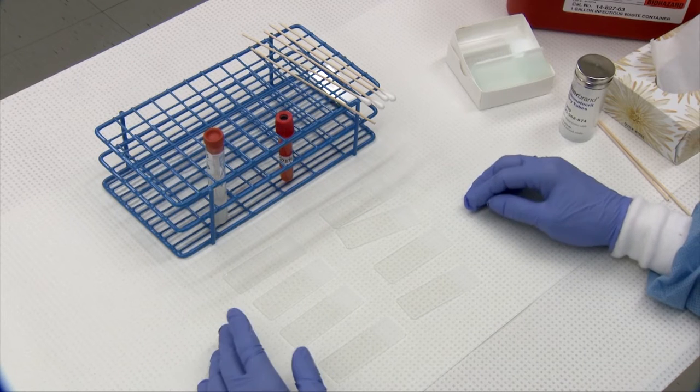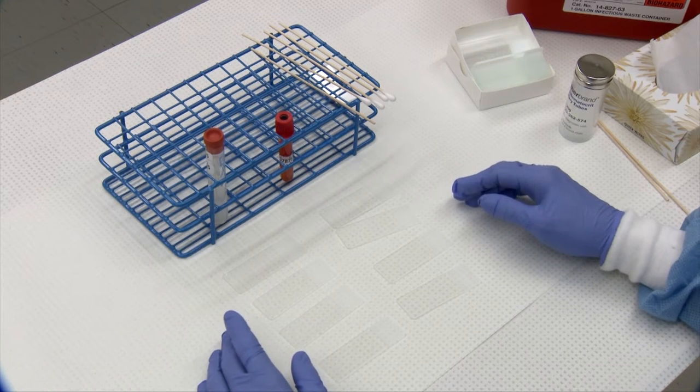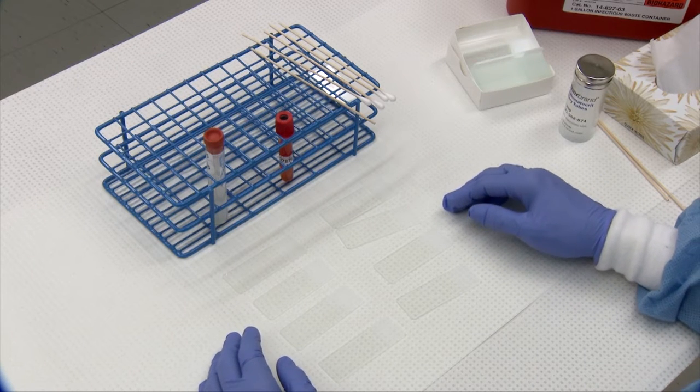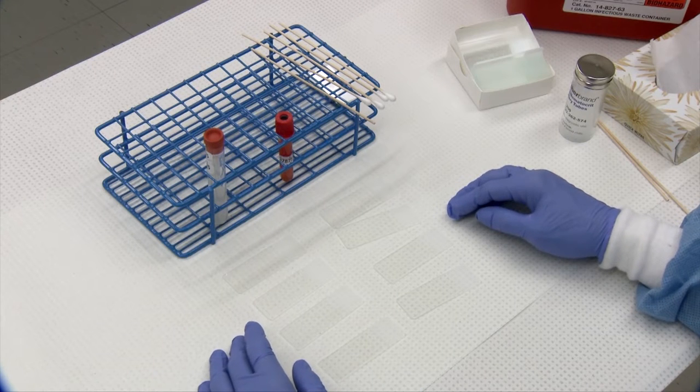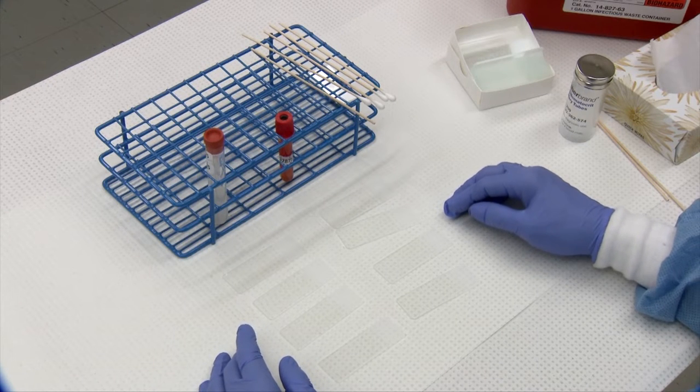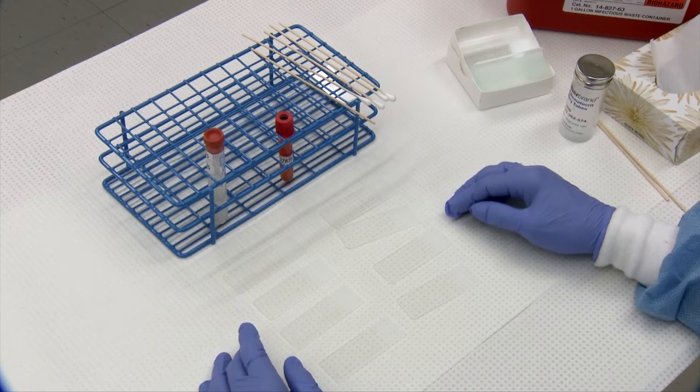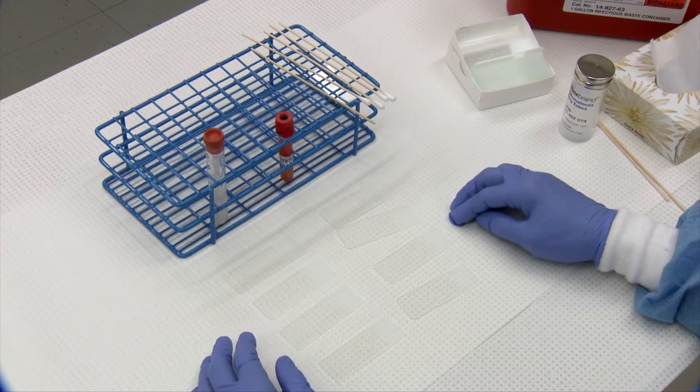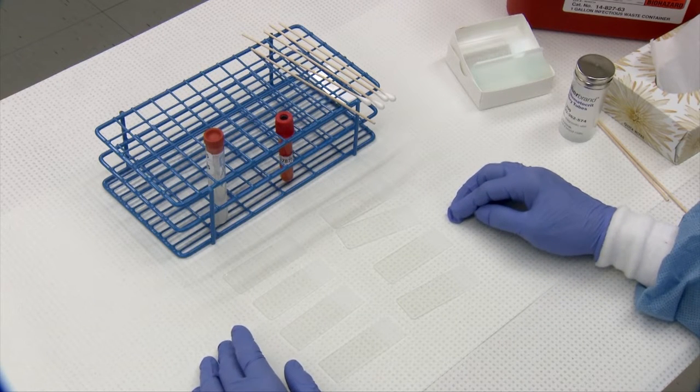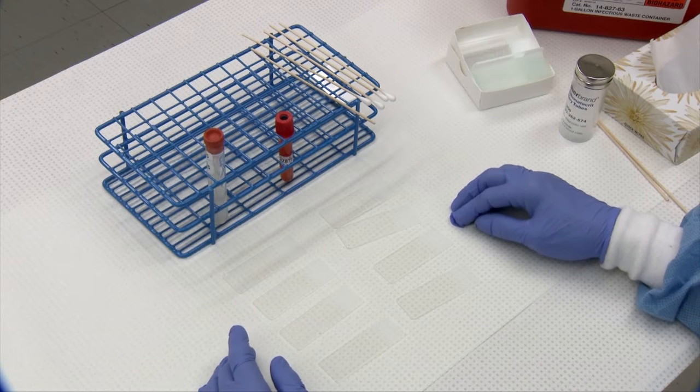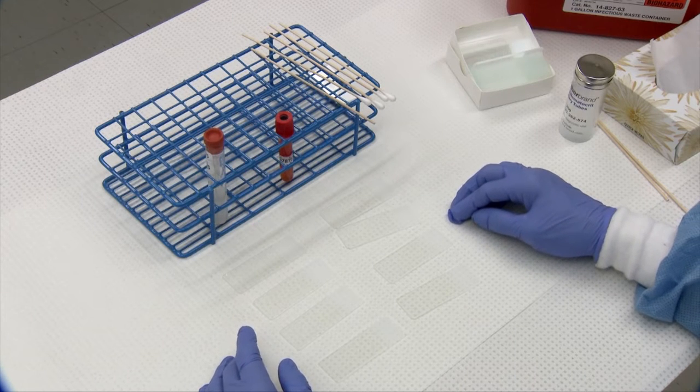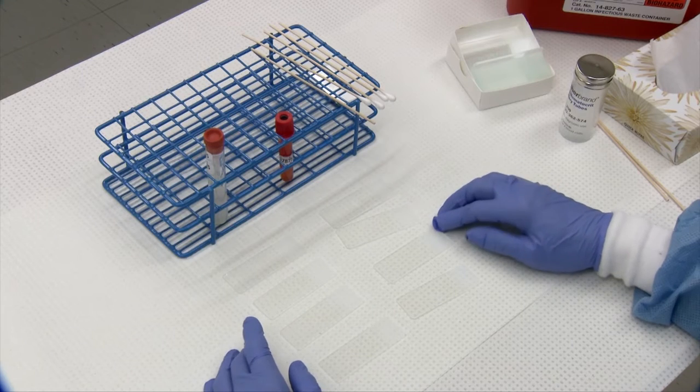The slide making process is the same for both. The difference is that body cavity fluids get a nucleated cell count, a red cell count, and a protein by refractometry. Nucleated cell count could be done on either the bioanalytic leukotic or if you have an automated instrument it could be provided off of there as well.